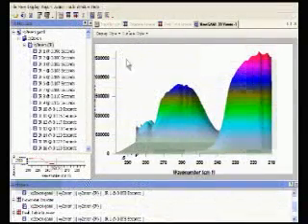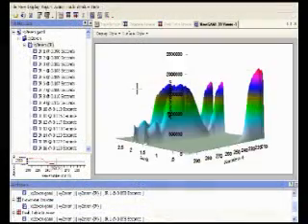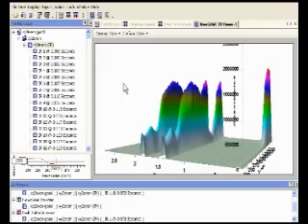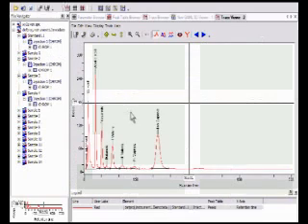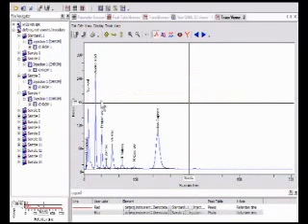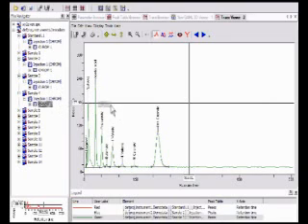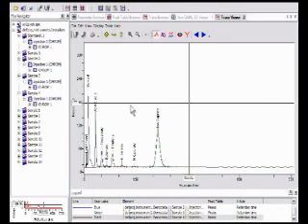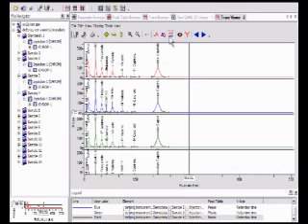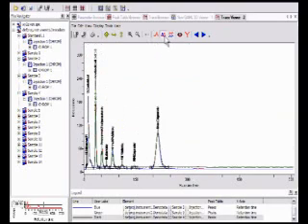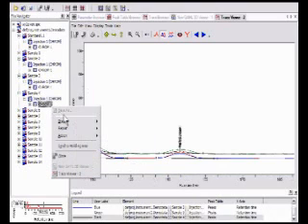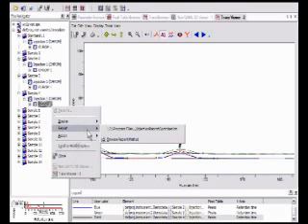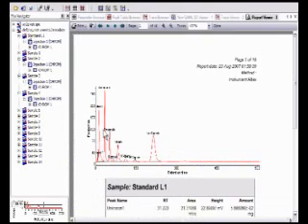Additionally, Nautilus provides interactive 3D viewing, manipulation, and reporting of raw instrument data. Chromatograms and spectra can be selected and compared as if it were in the original data systems. You can drag and view, stack, overlay, and zoom to investigate data in real time. Custom raw data reports can then be executed with a simple right-click.